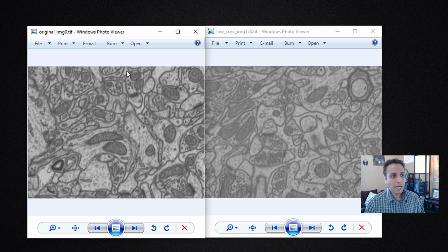I use the left hand side image to train an algorithm, but does it work on images on the right hand side? This one looks low contrast, and also the brightness seems to be on the lighter side. So this kind of looks like this image, but it's not exactly. Maybe some pre-processing helps, but is it time to retrain?